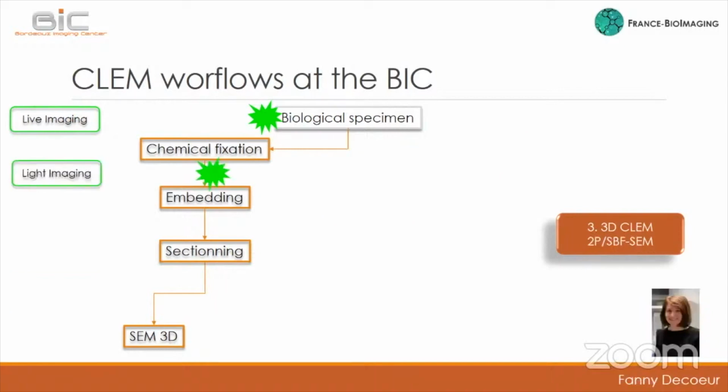At the same time, also a 3D CLEM protocol, very important here in the lab, is the use of a serial block face microscope, where they have an ultramicrotome integrated inside of the chamber, and they use light microscopy to mark the tissue and the region of interest, to be able to pass it in the microscope and then do the 3D reconstruction.